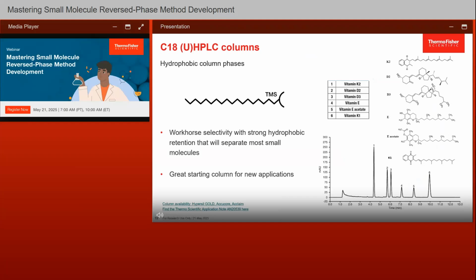The C18 phase is widely known as a general-purpose column, which is a balance of a non-polar retention for acids, bases, and neutrals. It's a good starting point to help understand the behavior of a particular sample and to determine if a C18 phase will provide the desired separation. C18 ligand is a long-chain hydrocarbon, and that's where the analyte would partition during separation.